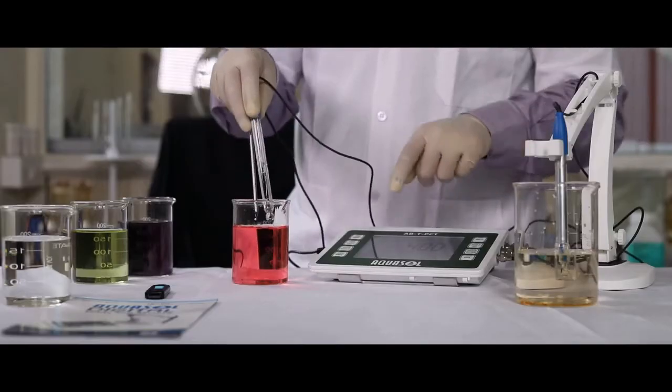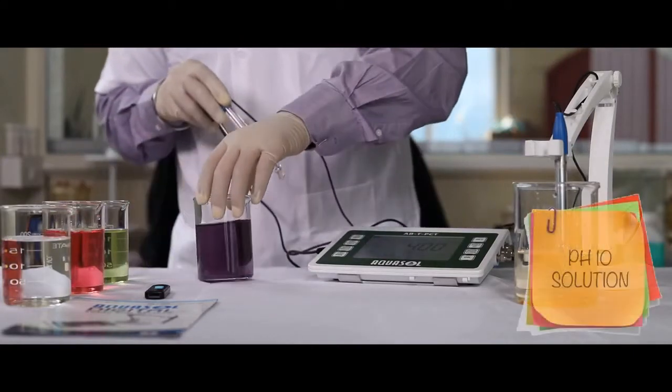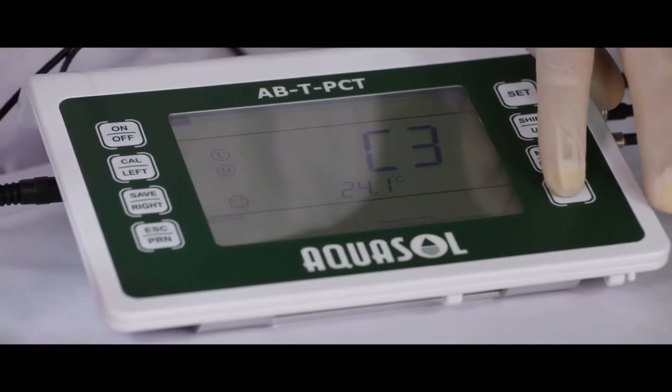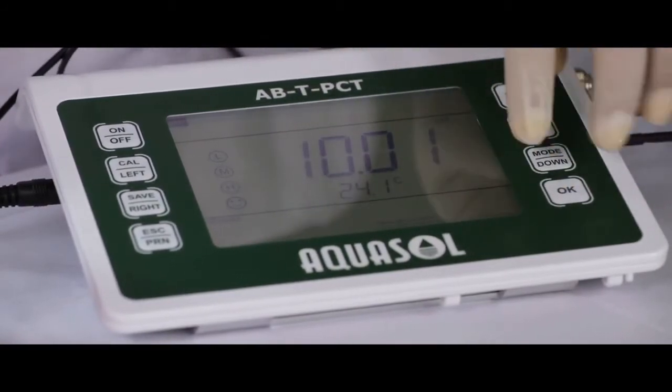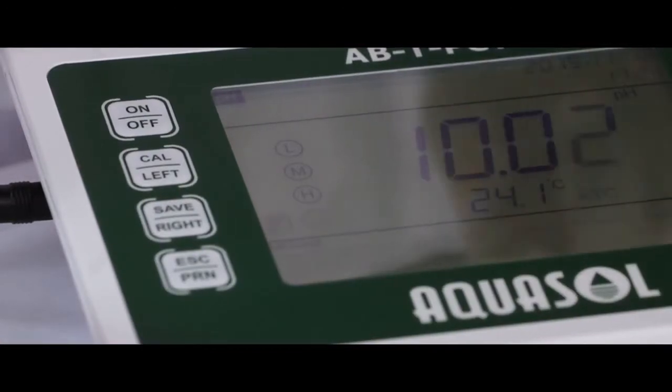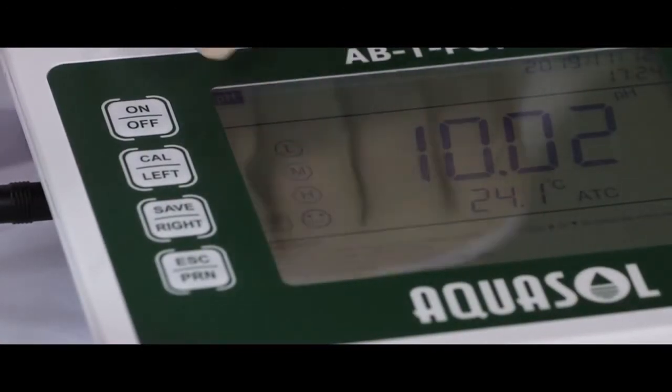Repeat the process for C3 with pH 10 solution. If all your calibrations are done right, the meter will display L, M, H. Once the pH is calibrated, let's calibrate conductivity.